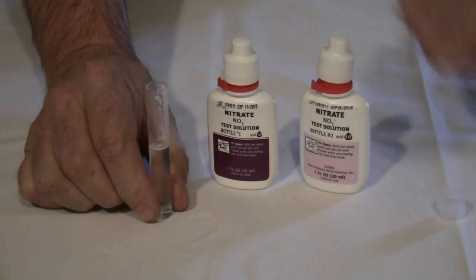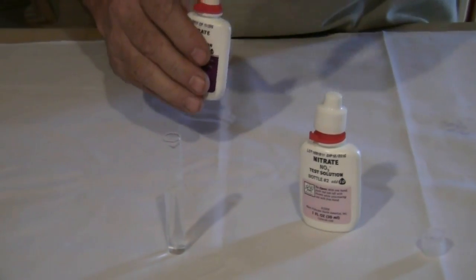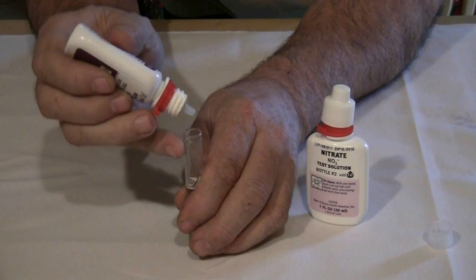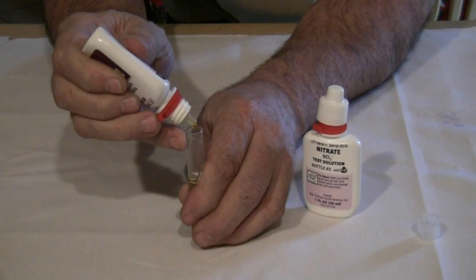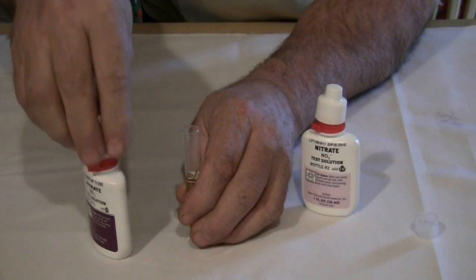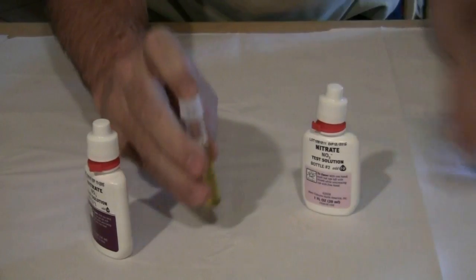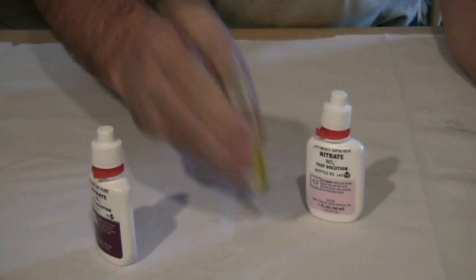In this case, our manufacturer has us add ten drops of solution number one. One, two, three, four, five, six, seven, eight, nine, ten. Put it in there and shake it up to get it well mixed in.